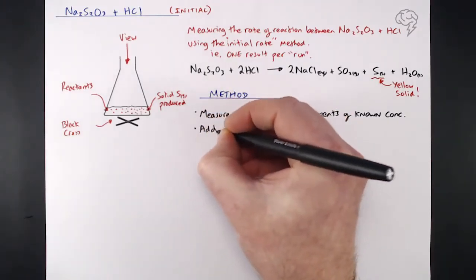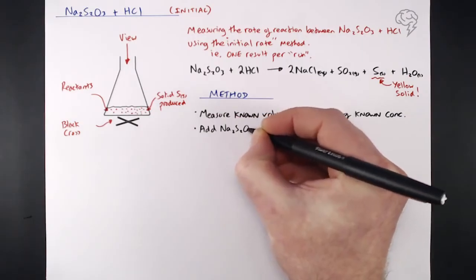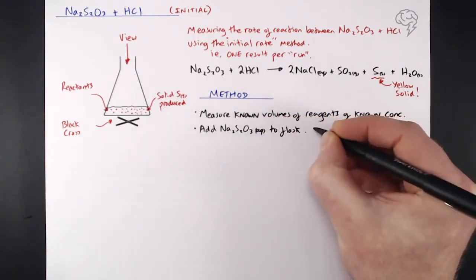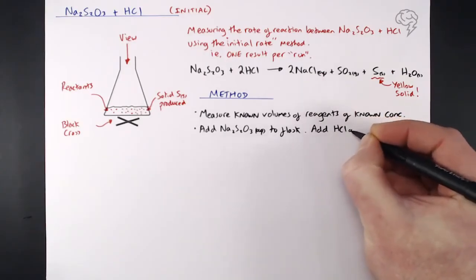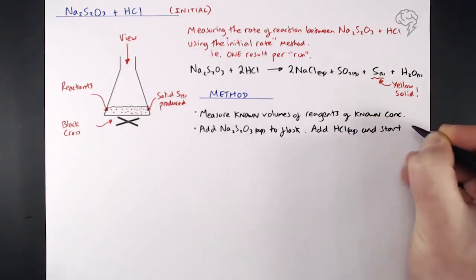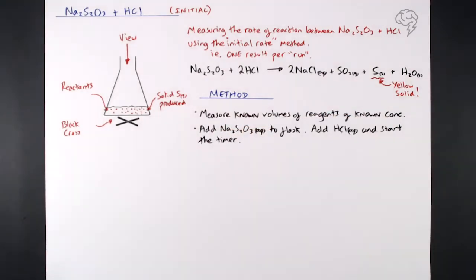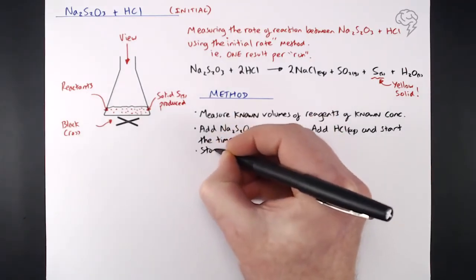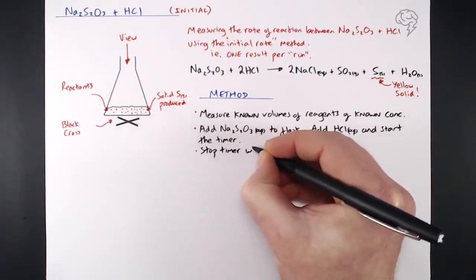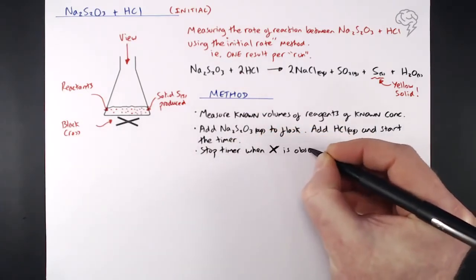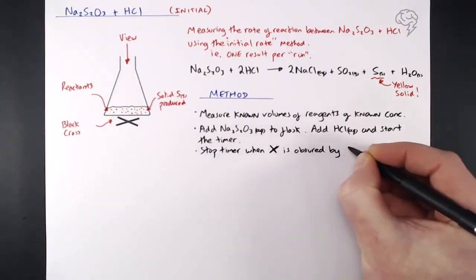When we're ready, what we do is we add our sodium thiosulfate to the flask. And because the HCl is usually a smaller volume, we add that second. And once we've added our HCl, as soon as we've done that, we need to start the timer. Usually give it a quick swirl, then put it back down on the cross. And obviously start your timer as soon as our HCl hits the sodium thiosulfate in the flask. We stop our timer when the X is obscured by the sulfur. So we can no longer see that black cross through the solution because of all that sulfur being produced.